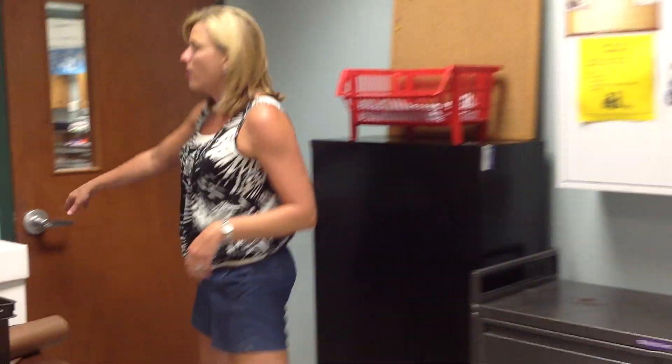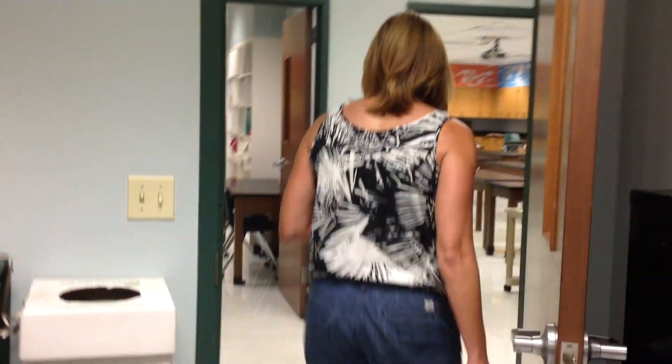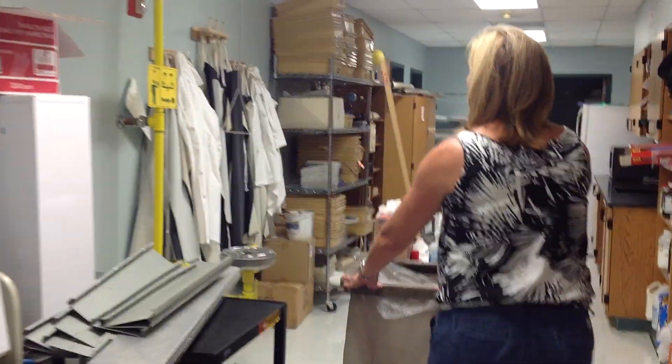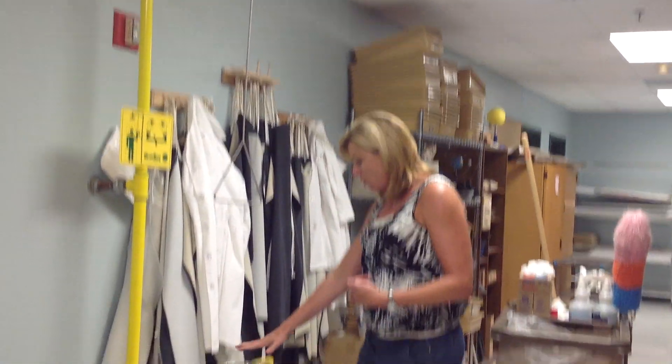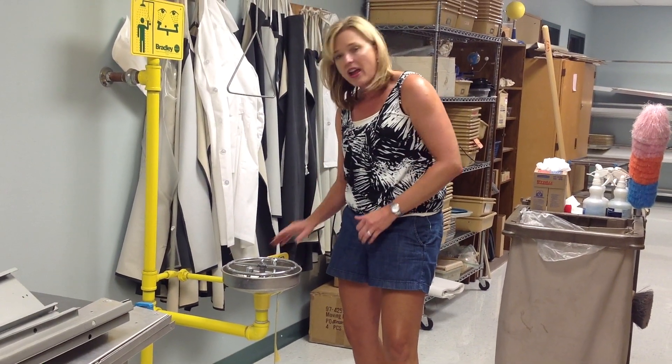Last but not least, if we should get chemicals on our body, or maybe chemicals in both of our eyes, back in the science store closet — which is a place you are not allowed to go unless you have teacher permission — we've got all of our materials that we use to prep our labs, and we also have a shower back here. Notice there's one very small drain. If you were to have chemicals over your body, you would pull this lever and it would rinse those chemicals off. If you get chemicals in both of your eyes and the one eye wash rinse is not sufficient, we also have a double eye wash station where you would lean down and the water will rinse into both of your eyes.